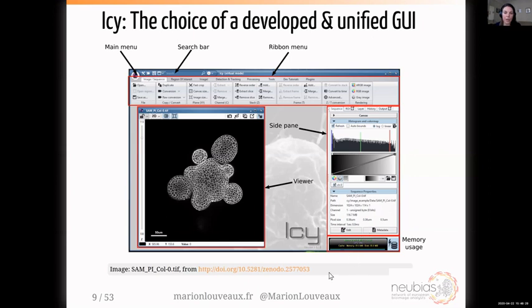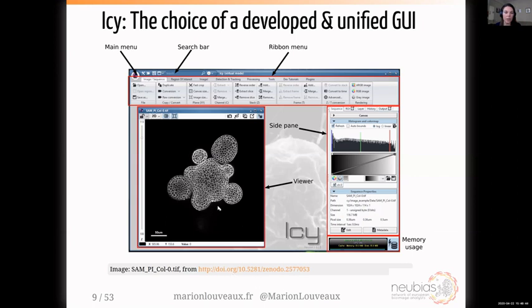Before continuing, I'd like to note that the images I'll use during this presentation are all published on Zenodo with a DOI so you can cite them. The first image is from a colleague of mine, Stéphane Verger, and it's a shoot apical meristem — the structure that gives rise to the future flowers of plants.